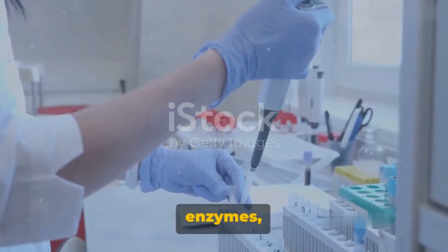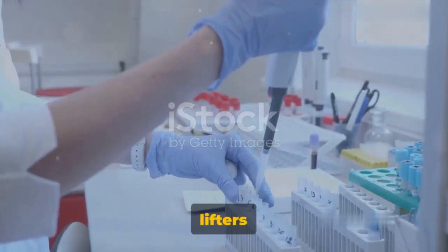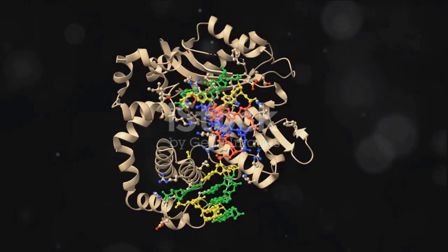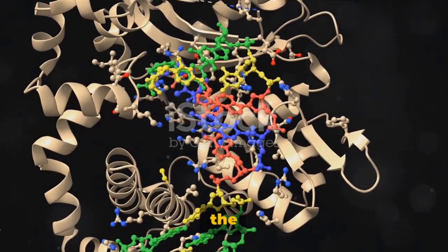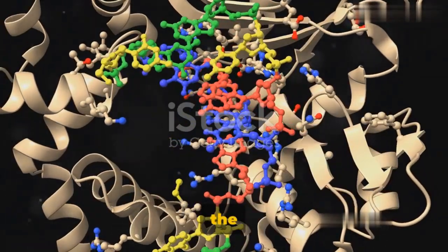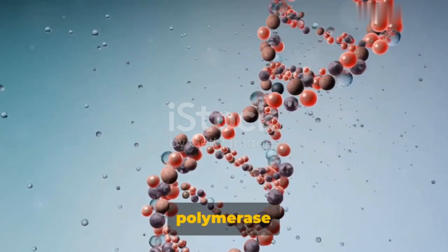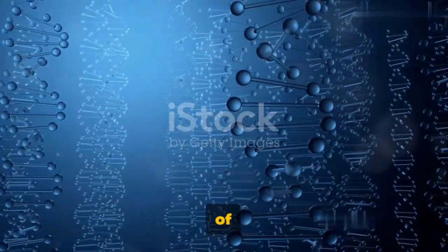Next, we have our enzymes, the reverse transcriptase and DNA polymerase. These are the heavy lifters in the RT-PCR process, each playing a crucial role in the conversion and replication of our RNA sample. Let's start with the reverse transcriptase enzyme. This is the enzyme that takes the lead in the first step of our RT-PCR process. It's a catalyst for the formation of complementary DNA strands from our RNA strand. This is why it's also known as an RNA-dependent DNA polymerase enzyme. In essence, it's responsible for reversing the central dogma of biology.